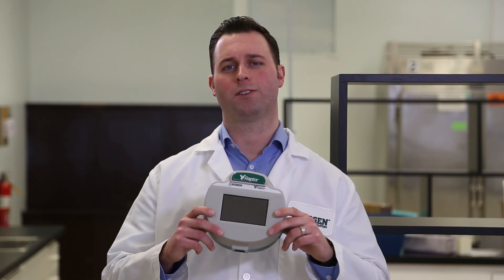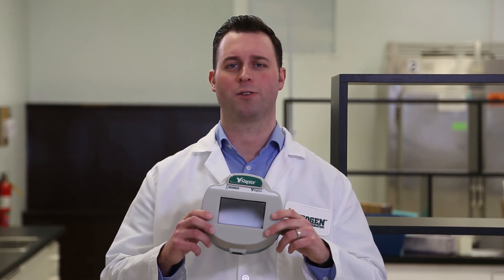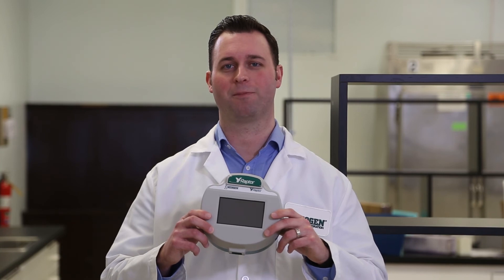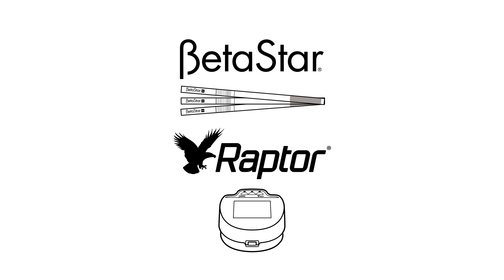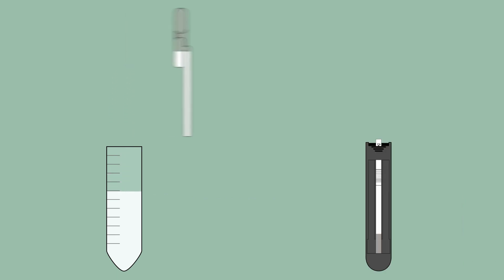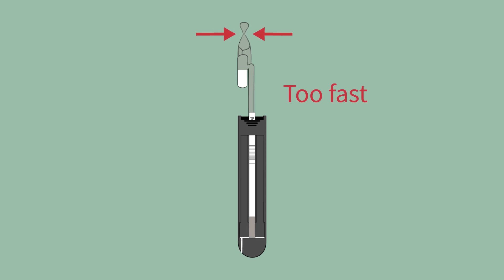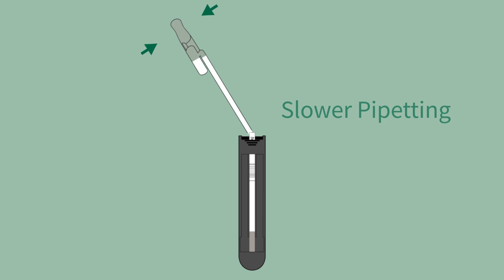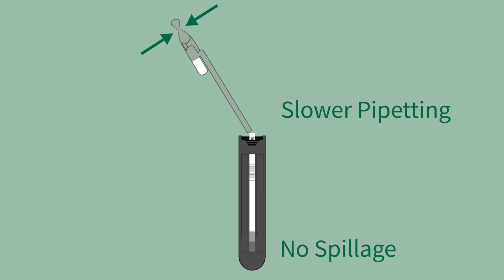Now a few best practices for using the Raptor Integrated Analysis Platform. When using Neogen's Betastar test strips with the Raptor Reader, one easy way to avoid user error is pipetting carefully. When pipetting your milk sample into the Raptor cartridge, don't squeeze too quickly — the force might cause milk to spill out of the cartridge and into the reader, or form bubbles. Squeeze smoothly and evenly so the milk stays where it belongs, better ensuring accurate results and preventing damage to the Raptor Reader.